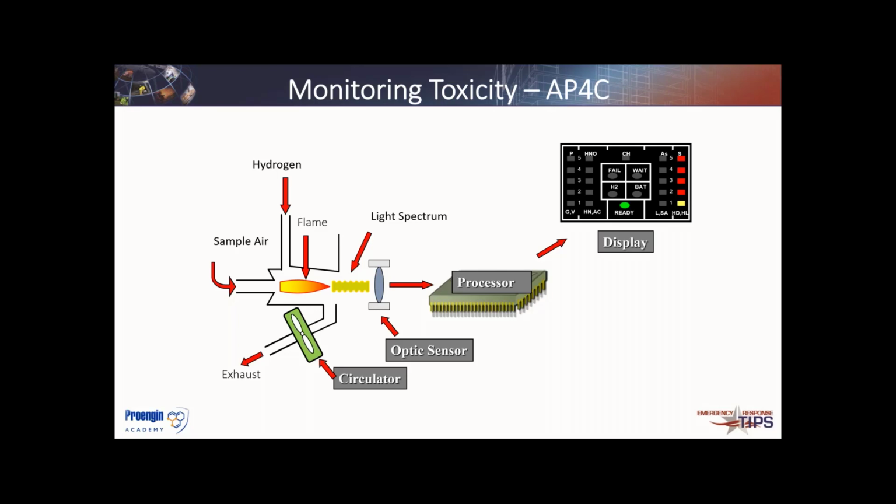What we aren't able to do, because we're only focusing on the light spectrum or the visible spectrum, is identify the specific compounds. The reason is we just aren't collecting enough information to delineate between those different materials. That's why a lot of the bulk processes take a while, because they have to collect information over larger spectral areas and then compare it against a known database in order to match those peaks in the transmission and absorption spectrum. The advantage of this is that because you're able to do this in real time, you get information that's important for assessing the situation.